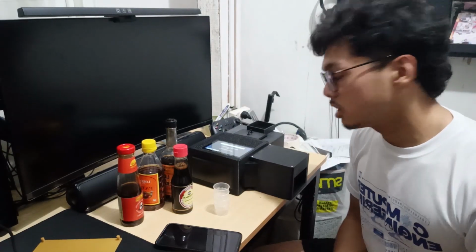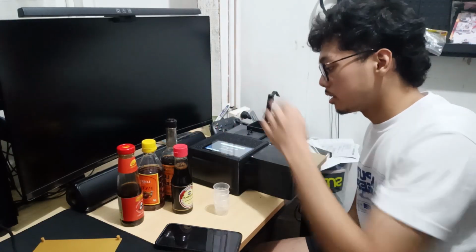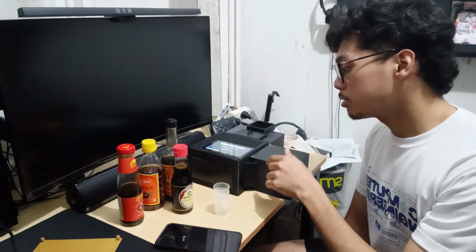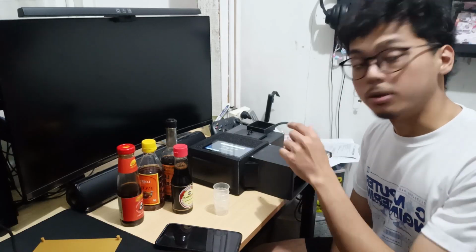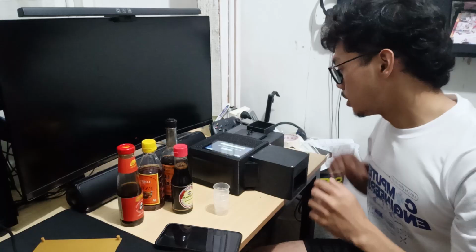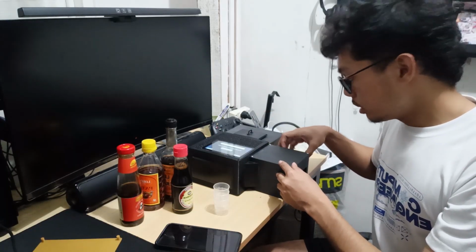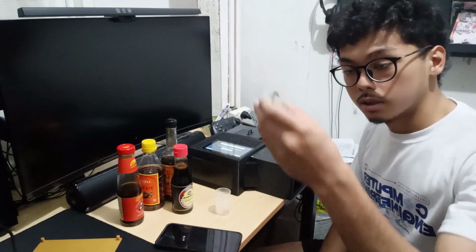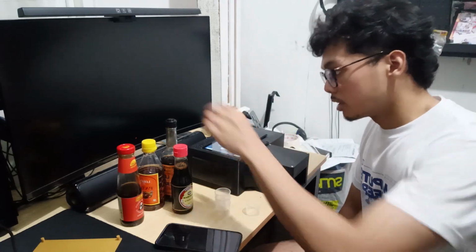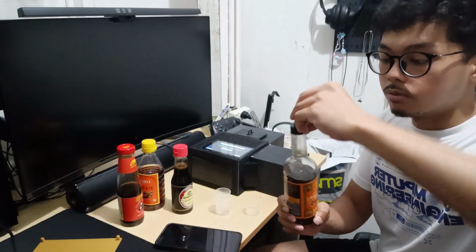Okay, so now the values are back to normal. So I'm going to stop the fan. I'm going to skip the exhaustion process because we still have a few minutes left. So I'm going to skip that. And then I'm going to close off the exhaust fan. And I'm going to take one of this plastic cup. Then place 10 milliliter of Worcestershire sauce.